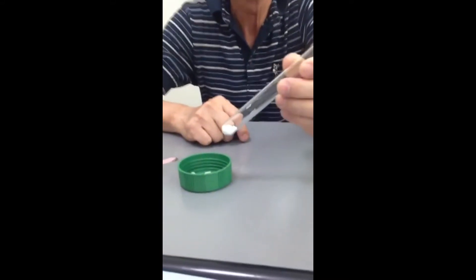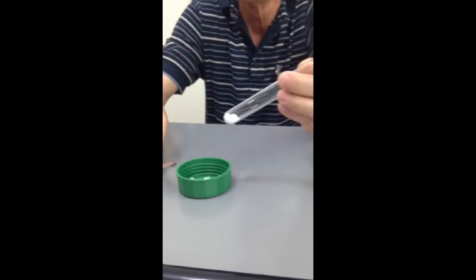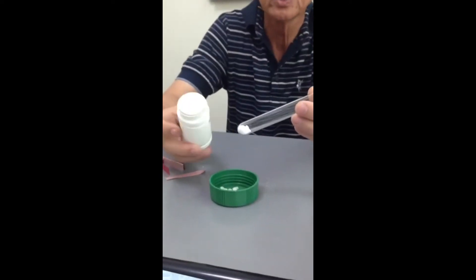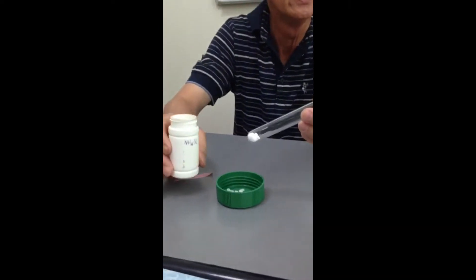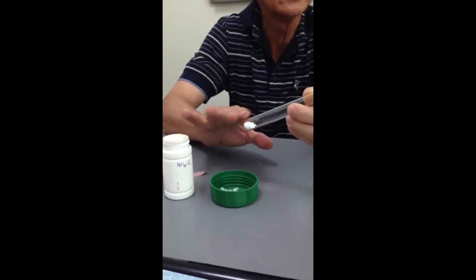Inside these test tubes we have white solid ammonium chloride, which is neither alkaline nor acidic.